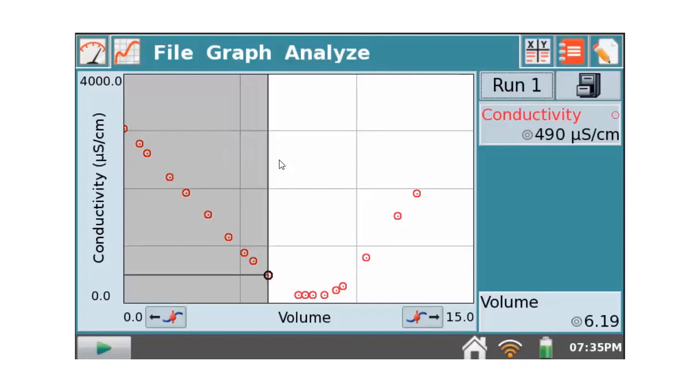If you're a better aim than I am, it looks like that. Tell it what kind of equation you want to fit that to, and it's going to look like a linear fit. Here's your slope intercept, all that kind of good information. You can use that information to work backwards to find out what that volume is, right where it hits the zero line in the plot.